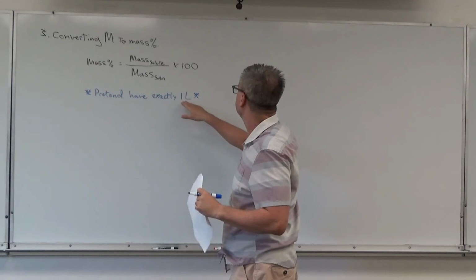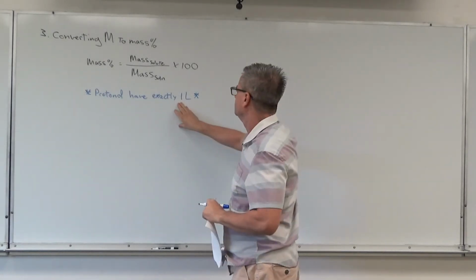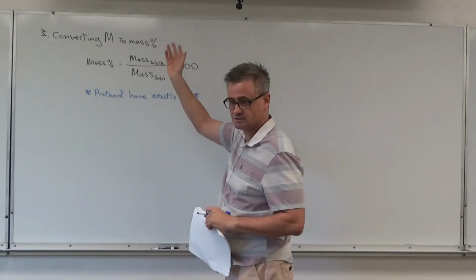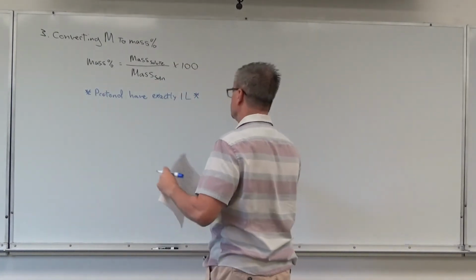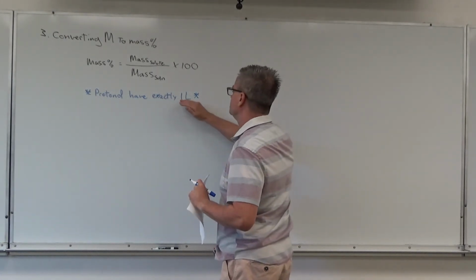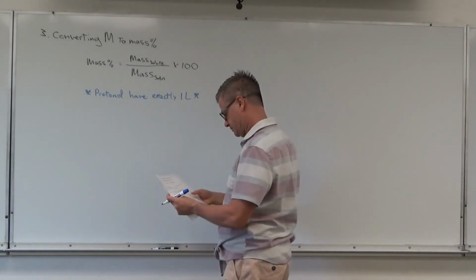It's hypothetical, so hypothetically you have that as accurate as you possibly could. The only thing that you're limited by is the molarity that you use, which is determined by the concentrations and the volumes that you use. So the fact that I wrote 1 there, don't trim off significant figures.